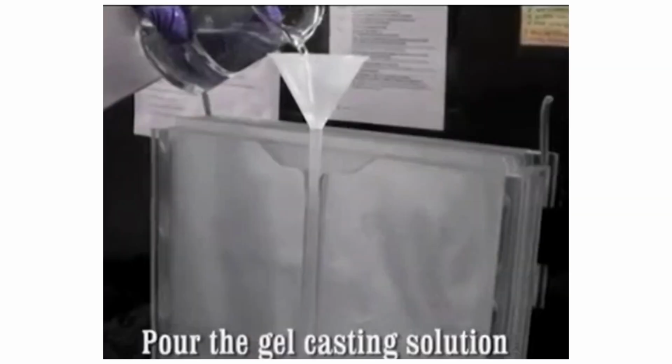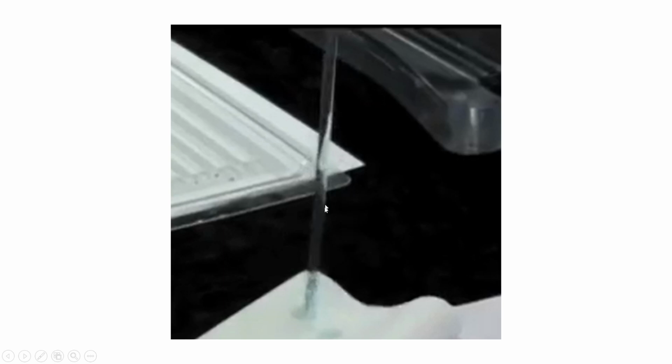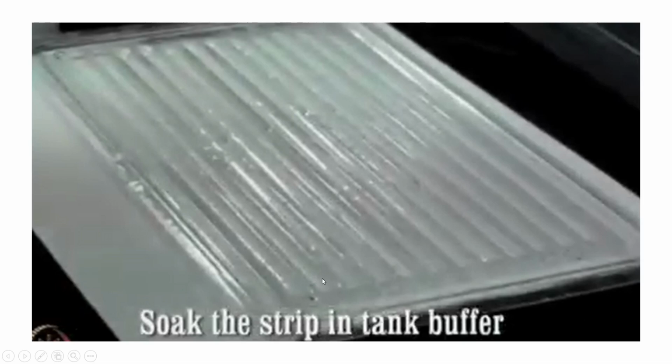For doing the second dimension, sir gave different animations of performing this specific experiment, as well as some practical demonstrations. If you have not gone through those videos, at least you can go through how exactly it looks practically. But I have still tried to crop certain images and show you, so that it becomes easier. So this is how the gels are made, and this is the gel, if you can see here. So this is the equilibration step, you can say.